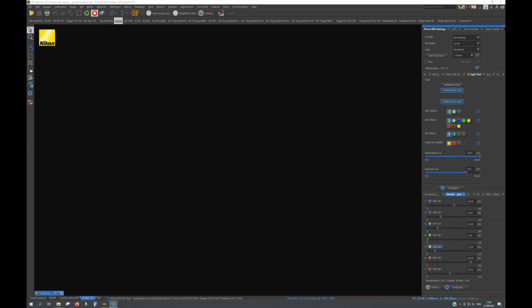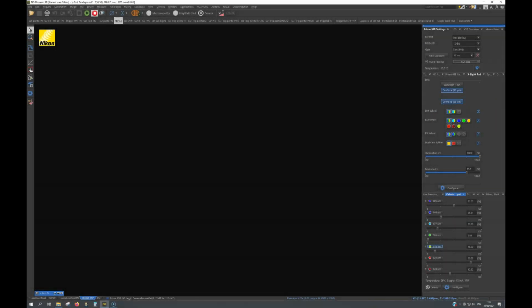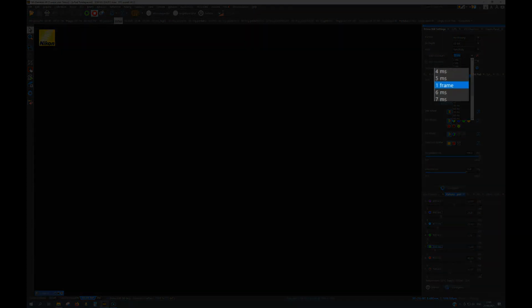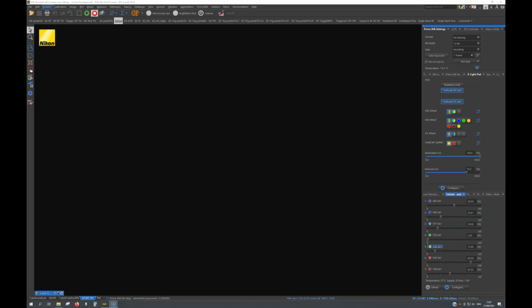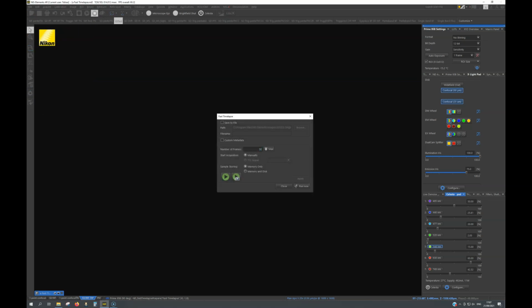For later comparison, we will now acquire stacks using a region of interest. From the drop-down list we will choose the 512 by 512. We will also need to reset the 1 frame, as the limited ROI will take less time to image compared to the full frame. You can see that the 1 frame acquisition time is now between 5 and 6 milliseconds. This is because of the smaller amount of pixels in our region of interest. We will now go on and acquire 50 consecutive images as fast as possible for our region of interest.